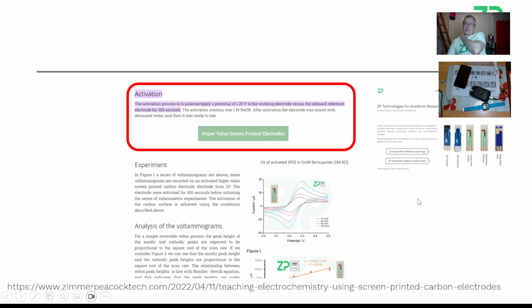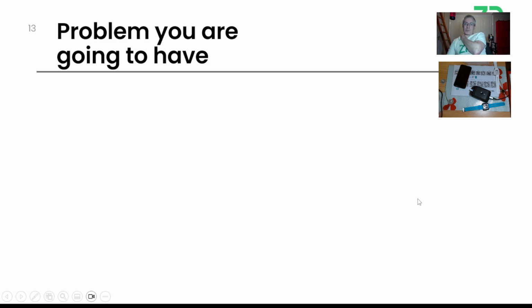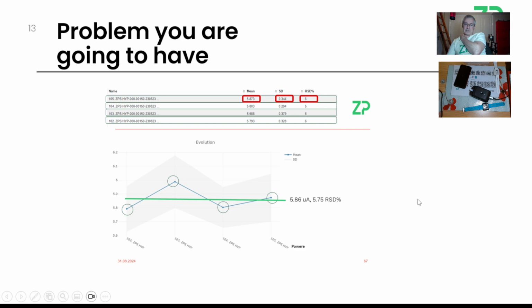I think you're going to have a problem, and your problem is going to be one of reproducibility. When you use otherwise the same solution on different electrodes, you're going to find yourself with different peak heights, and you're going to get pretty annoyed, and it's actually down to reproducibility.